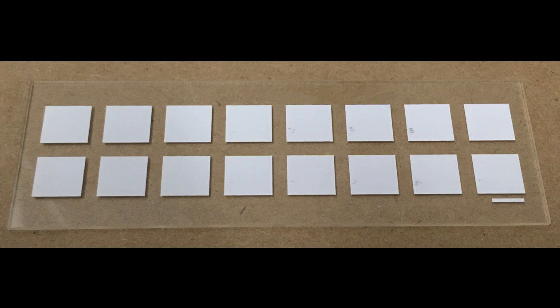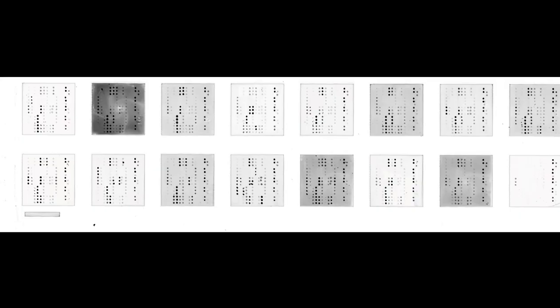And let me show you the results. So this is in 2 channels, and you can see very nicely the signal of interest, the red one, and the difference in intensities of the protein spots. I also like to watch this in black and white, the channel of interest only in black and white, so you can see it even a bit better.